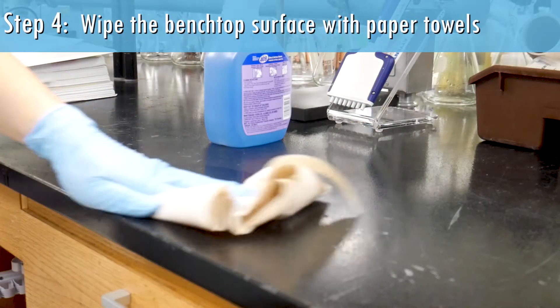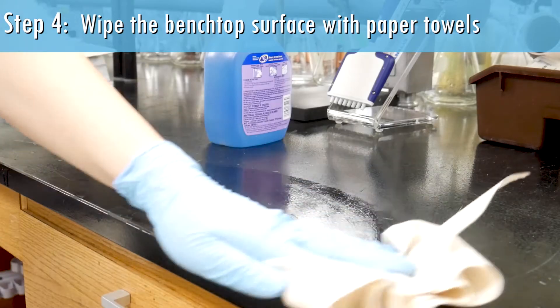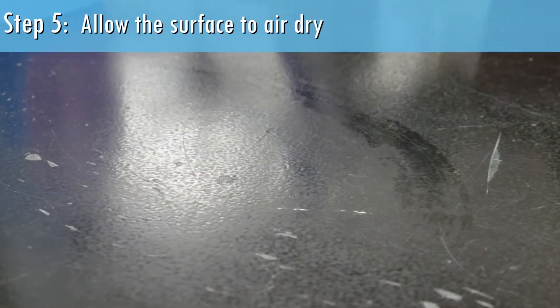Wipe the benchtop surface with paper towels. Allow the surface to air dry.